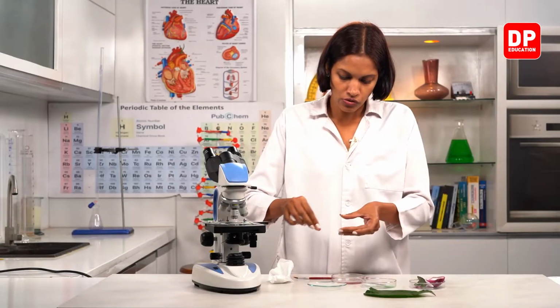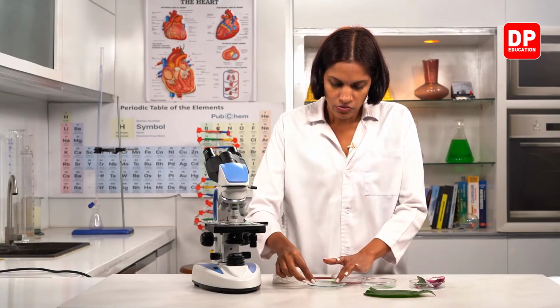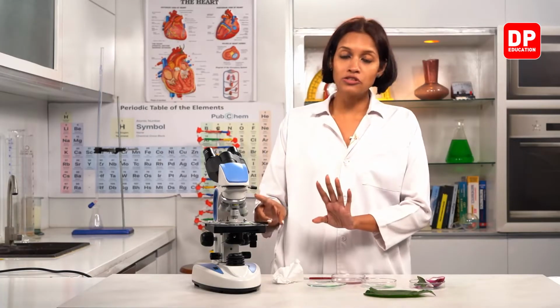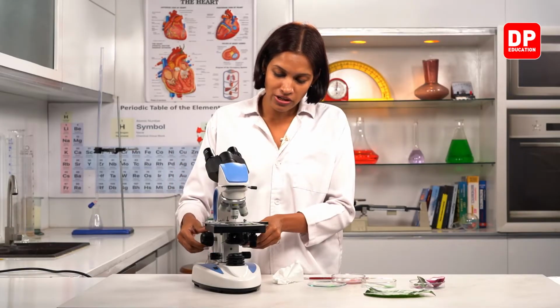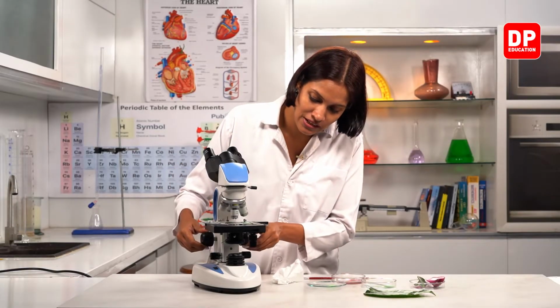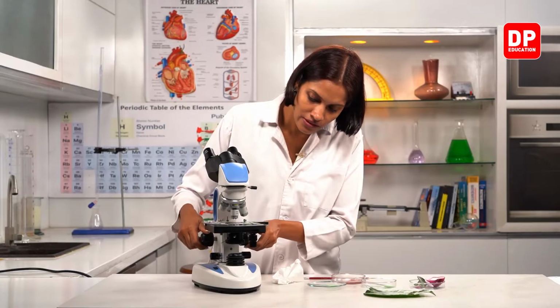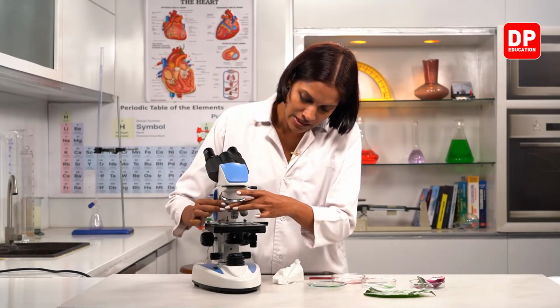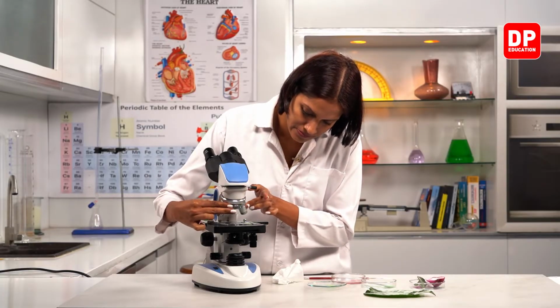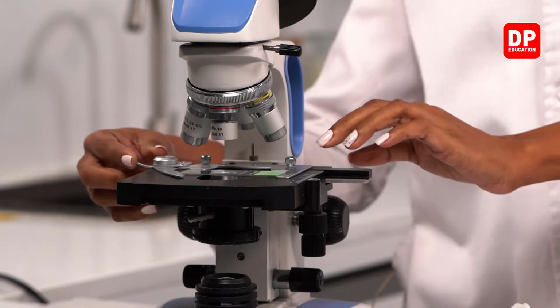Right, now we need to mount this one. So before we mount this one, we need to remove the previous slide. So again, you all know that when you remove this one, what you have to do, children? You need to turn it to low power and then remove the slide.